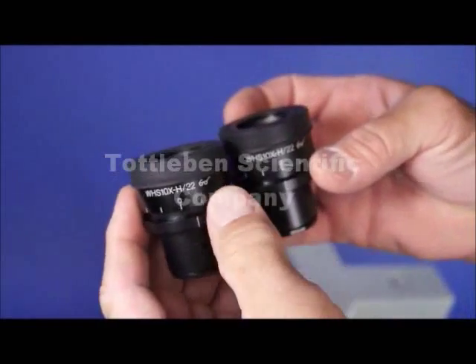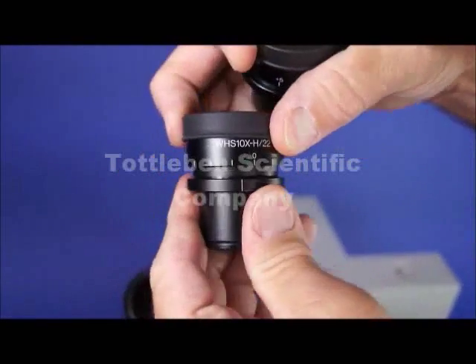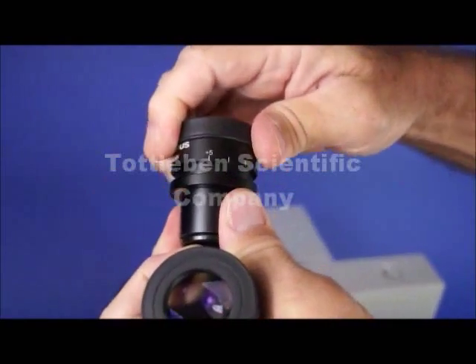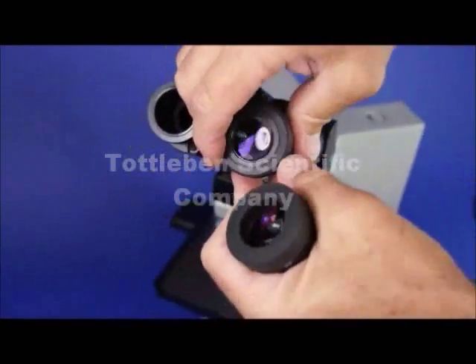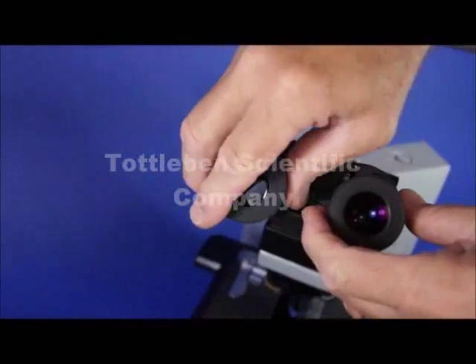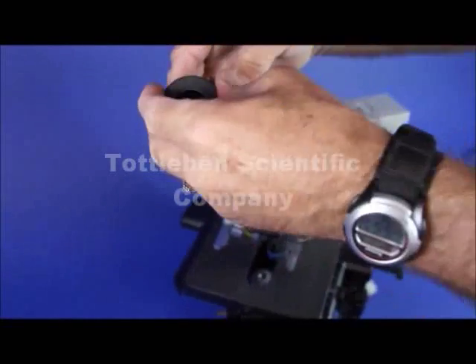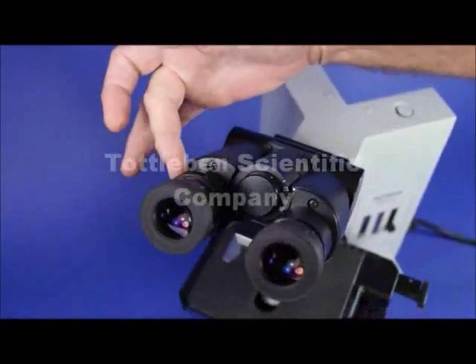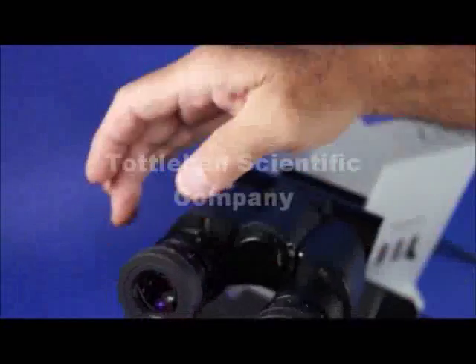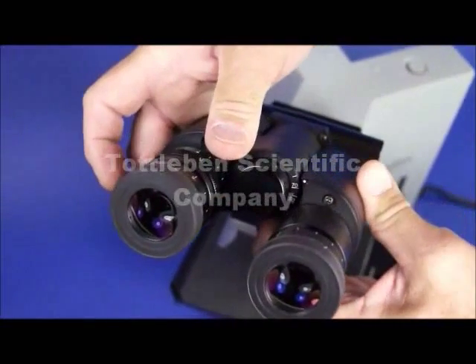They're also corrected for a high eye point for eyeglass wearers. They both turn very smoothly, which is a sign of quality. Olympus is one of the best microscopes out there. It also comes with a left diopter focusable, so you have two focusing eyepieces, which means you're always going to be able to stay in par focality no matter who uses the microscope.